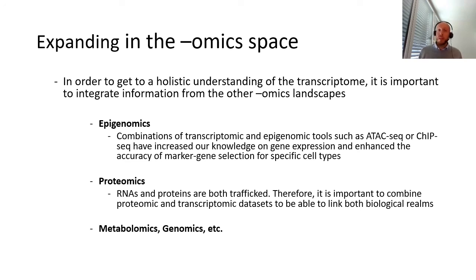However, today we know that RNAs can travel long distances within tissues, so the location of a transcript must not necessarily be its origin. And to make things even more complicated, we also know today that simply knowing the position of a transcript does not always correlate with the position of the corresponding protein. So a combination of knowledge between spatial proteomics and spatial transcriptomics is therefore inevitable. And of course, it doesn't stop there. We are convinced that better data integration from all the omics spaces, from genomics to metabolomics, will help us gain a holistic view of biological processes and boost our understanding of life itself.